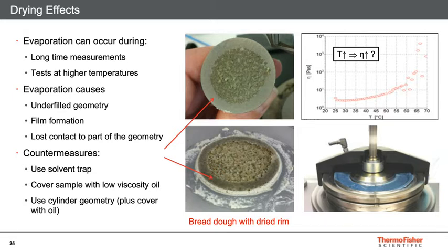So you can load solvent on the inside. This hood actually dips down into that solvent. You're going to add solvent out towards this outer edge beyond the blue paper that you can see by the sample. And by doing so, you add that hood, which encloses the environment, and the solvent that you add will saturate the local environment around your sample, so as to limit any evaporation effects.